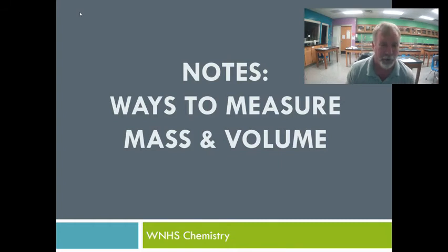So now I want to talk a little bit more about how we're going to actually measure the volumes and masses of objects in chemistry class. On to the next part of our notes. In this part, we're going to talk about ways to measure mass and volume. We learned a little bit about measuring volume with our graduated cylinder a moment ago. Now we're going to take it a step further. So I'm going to talk about mass first.